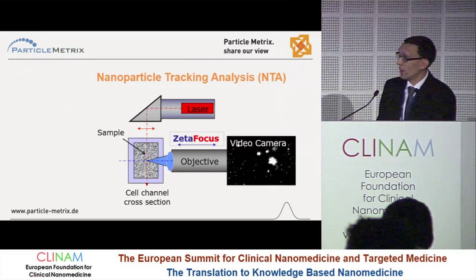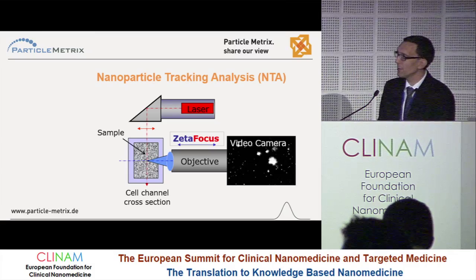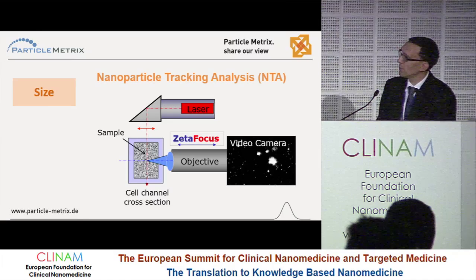So what brings me here is that I focused the talk on nanoparticle tracking analysis, where you visualize the particles via a laser. The laser shines within your dispersion, and the light scattered from the particles is collected by an objective and magnified onto a video camera. By taking a video and analyzing it step by step, we measure the particle size distribution from the displacement of the particles.